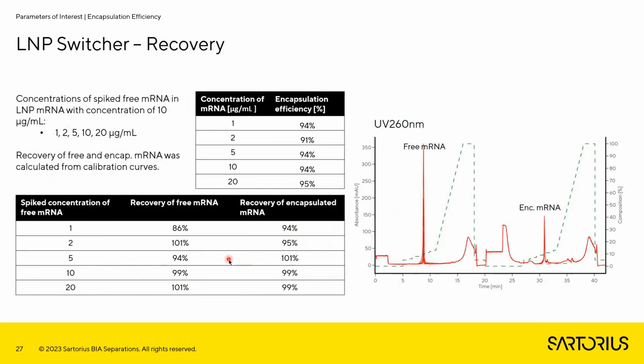We also checked the recovery of encapsulation efficiency for different concentrations of LNP particles. We have quite stable determination of encapsulation efficiency at different concentrations of LNP particles. This was the same sample analyzed.